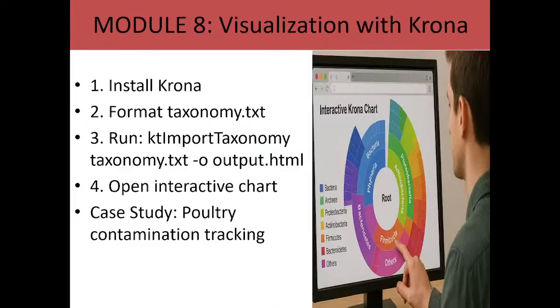Okay, so the next thing is module 8, and that is visualization. This is the point where our result is becoming more attractive and more interesting.